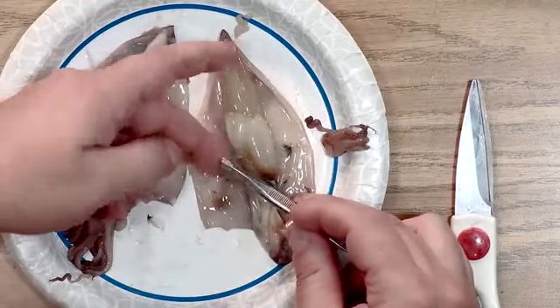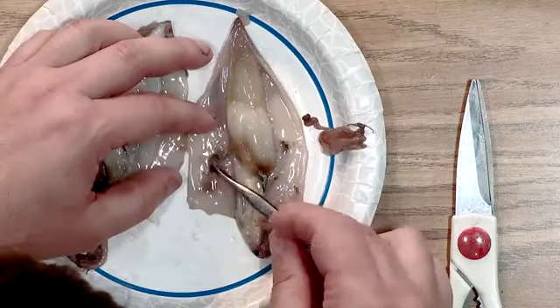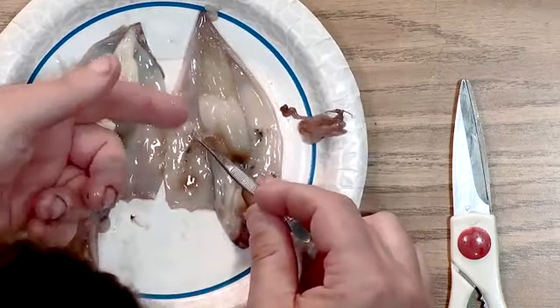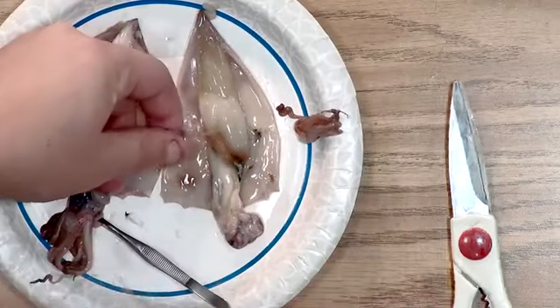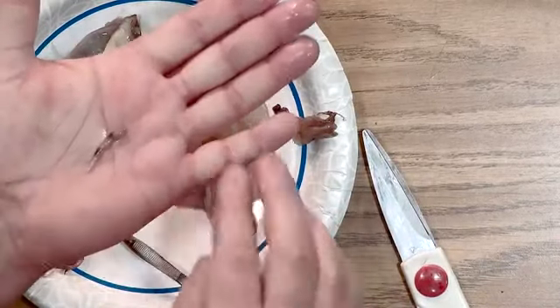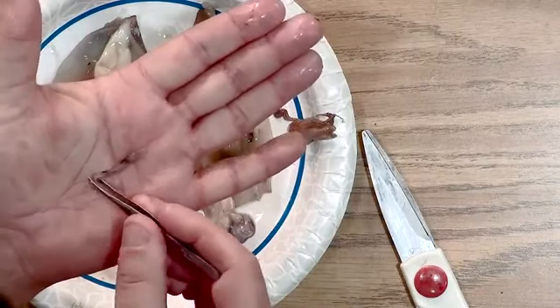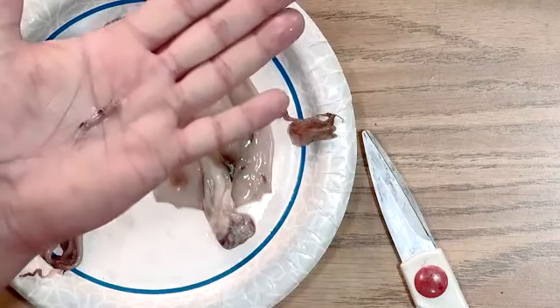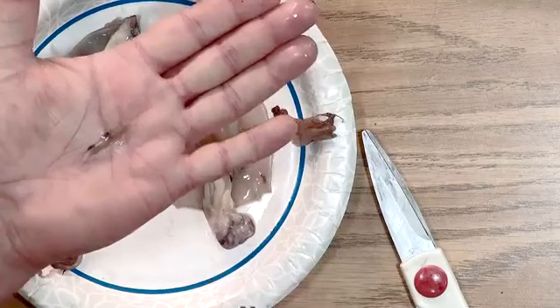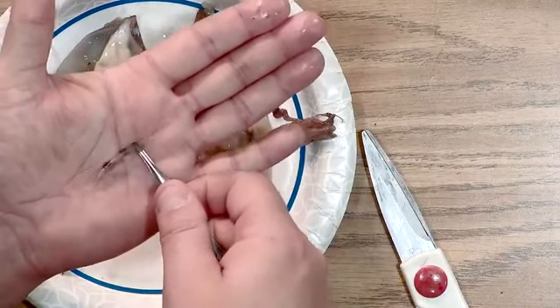All right, so this gill or lung sac here, I'm trying to separate it from the body a little. And it breaks. Awesome. Okay, what I'm going to do here is use my scissors to cut this, and I'm going to put it in the palm of my hand so we can kind of look here. And now some of that black stuff hung on here, but this is pretty amazing. This organ has its own heart to control it. That's just phenomenal. This creature has 3 hearts.